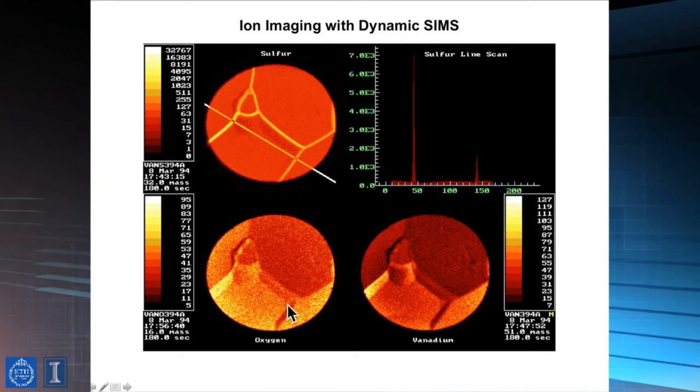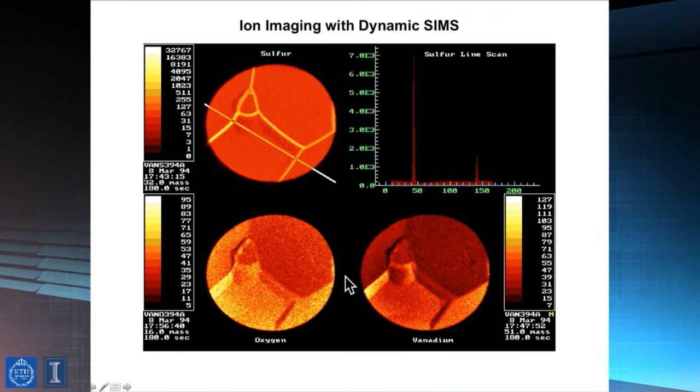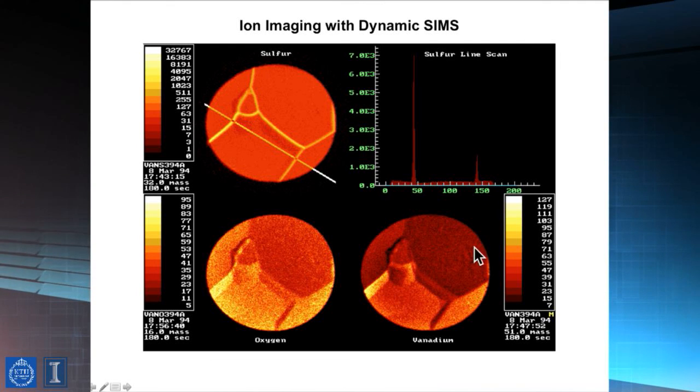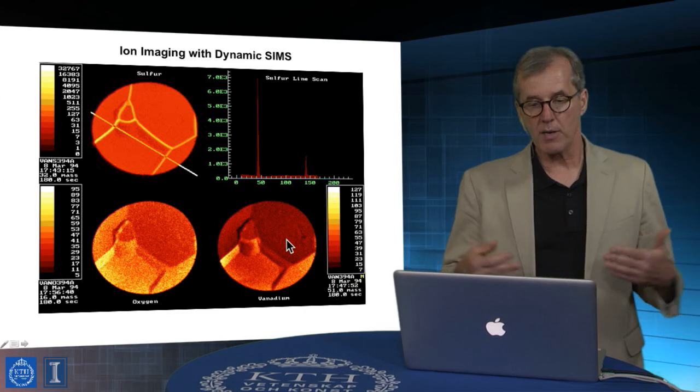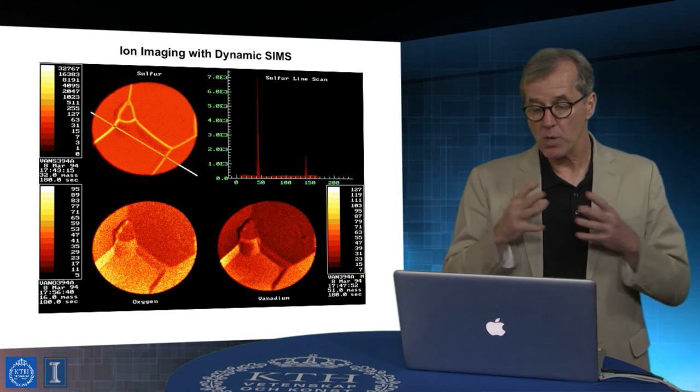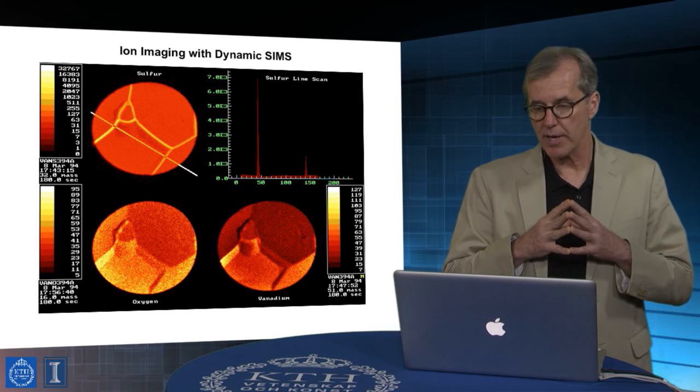It may be localized more in some grains than others, so there might be a more complex issue here associated with background. But you notice that these intensity differences are correlated against the vanadium content. So this is a granular structure, but there's also embedded within it, from an atomic perspective, strong compositional heterogeneity.